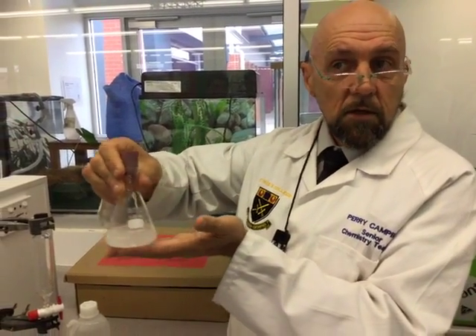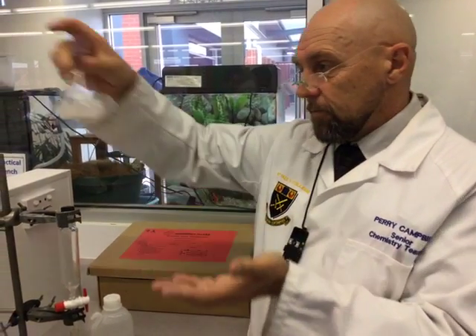That's going to sit for 24 hours. Make sure you label this so that you know it's yours. That goes into the fume hood, and then tomorrow we pick this up for distillation. Everybody okay with the extraction? Alright, brilliant.